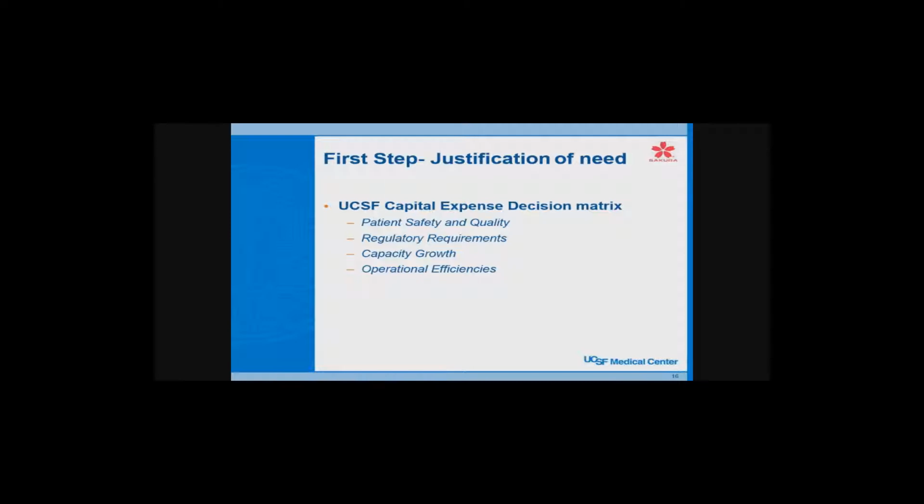So now we're going to get into how you go about implementing this kind of system. And of course, the first thing you have to talk about is money. Do you have money to do it? Some places build their own systems. Maybe they have some talented people that sit down and just work it out. Small laboratories can often do this on their own. As you get larger and more complicated, you need a commercial system that's going to cost you some money. Plus, all the hardware costs a lot of money.